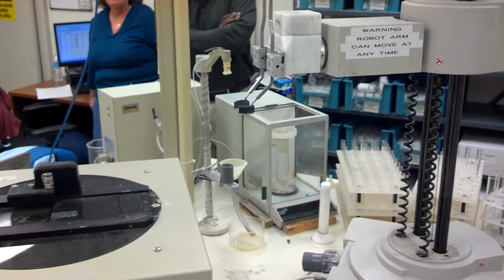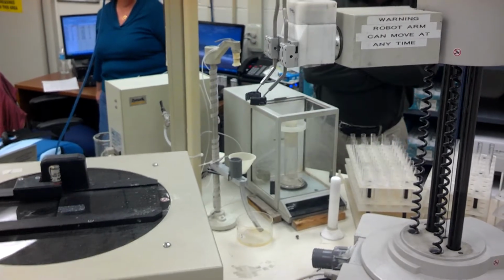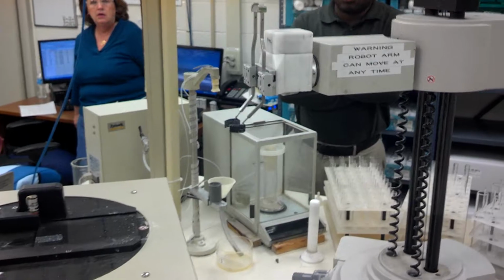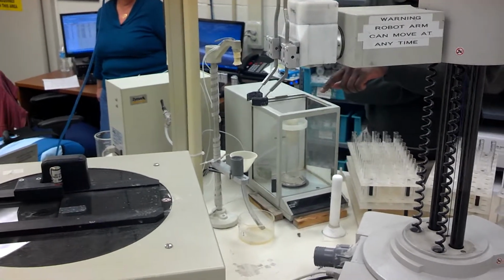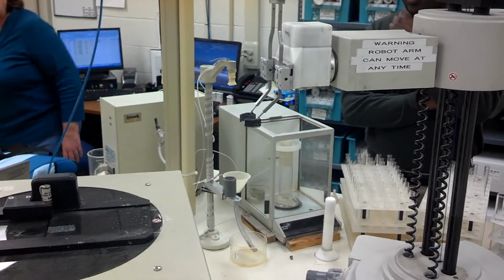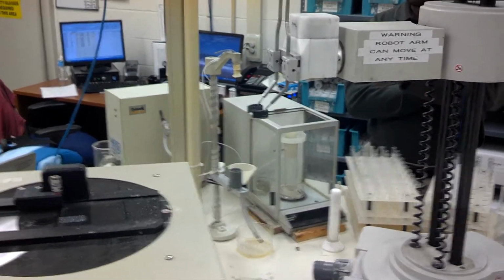Impression. Now it took one of those tubes out, and then it put one in as being centrifuged now, and it's still waiting. What's going to happen to the tube it took out? It's going to eventually take that out and it's going to weigh it over here. So is there a reason for the long delay in doing that? I don't know the reason for that. It takes 15 minutes. It has to be in a centrifuge 15 minutes.